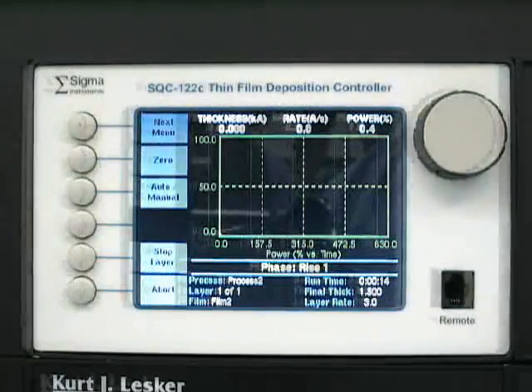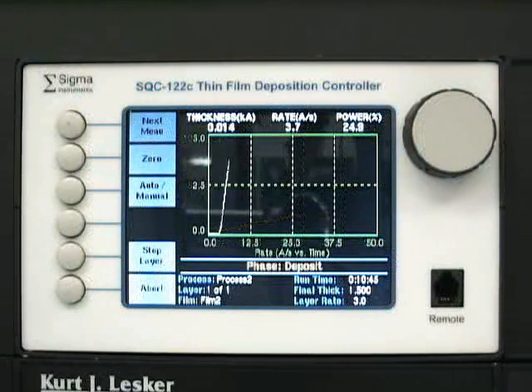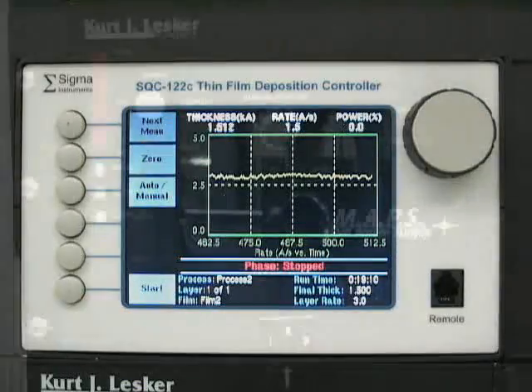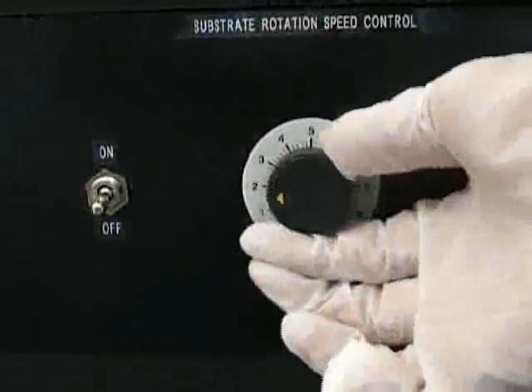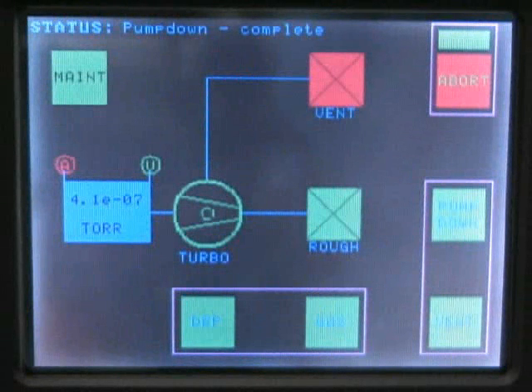You should monitor the entire deposition process to ensure proper execution. If any problems should arise during the deposition process, you should contact an MRC staff member. The deposition process on the PVD system is fully automated and will end once the desired thickness is reached. Once the first metal has been evaporated and you are planning to evaporate more than one type of metal, set the deposition monitor to the next metal type and select the appropriate electrode pair on the source selector. If you have completed your process run, turn the filament power switch to off. In order to remove your sample, you must first vent the system.